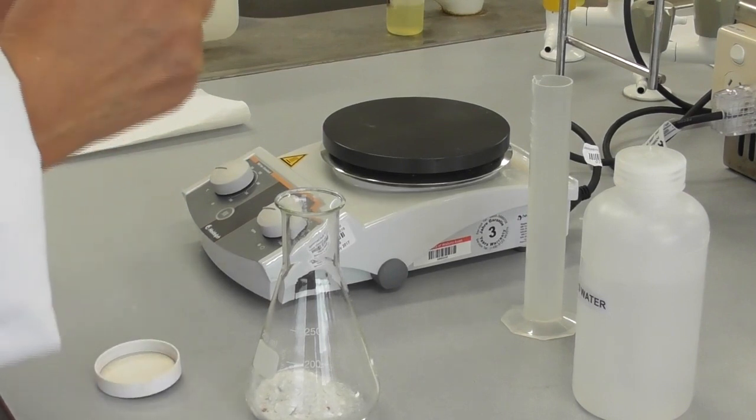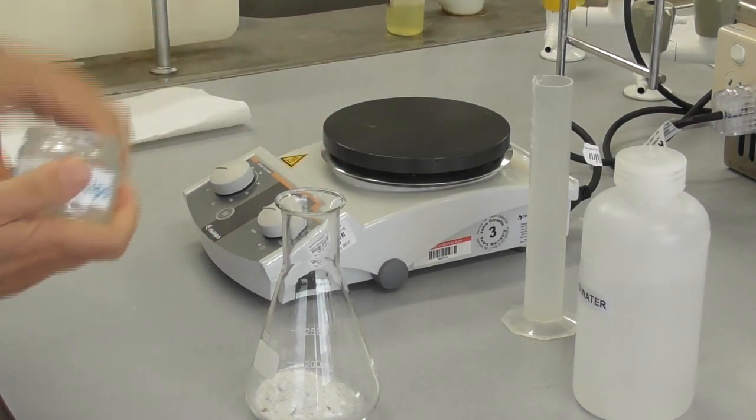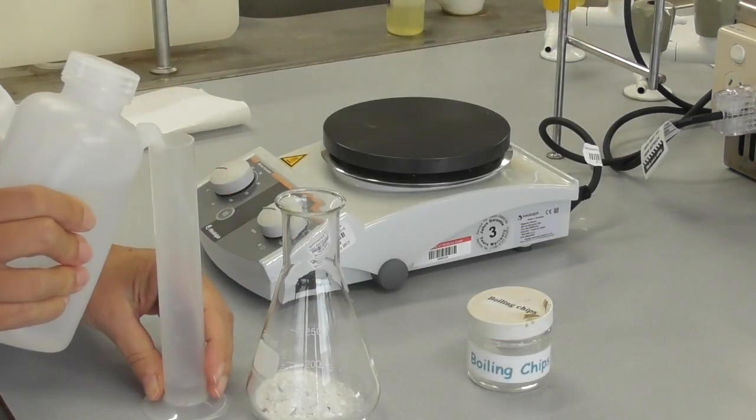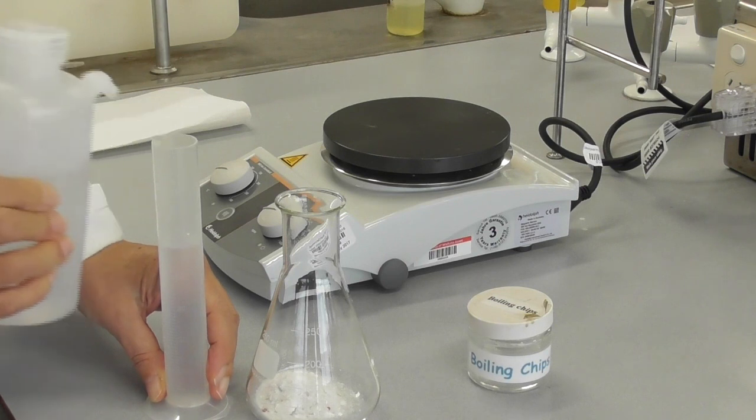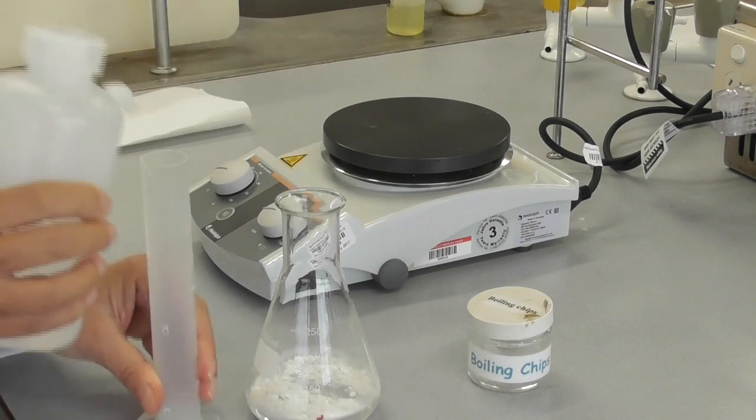Next we add a few boiling chips, 3 or 4 or 5 will be appropriate, and then we measure out 100 ml of distilled water. We add this into the flask with the benzoic acid and the boiling chips.